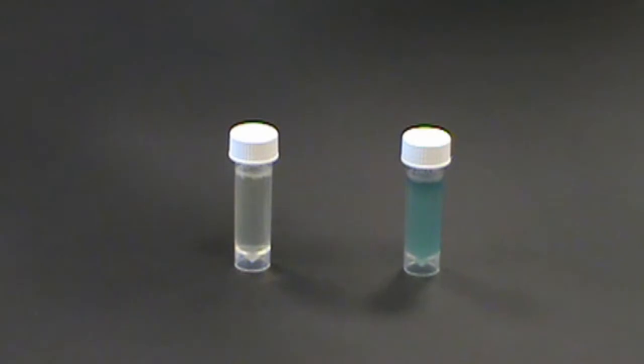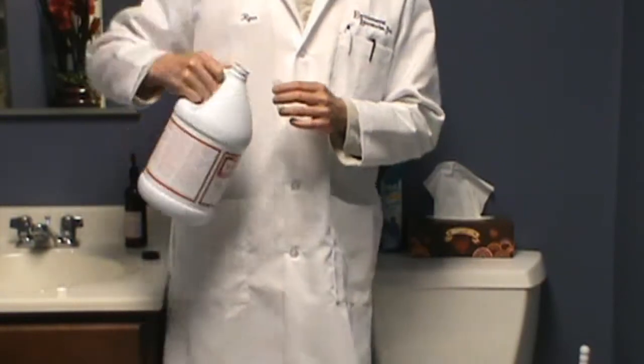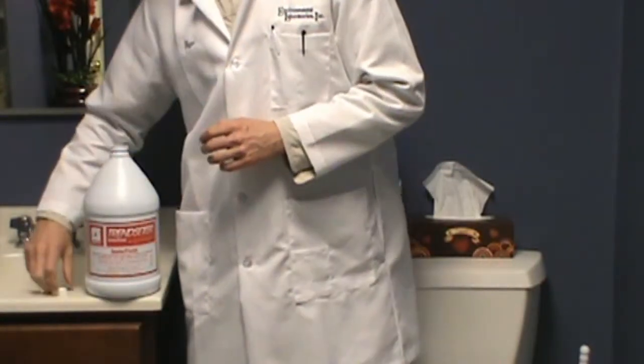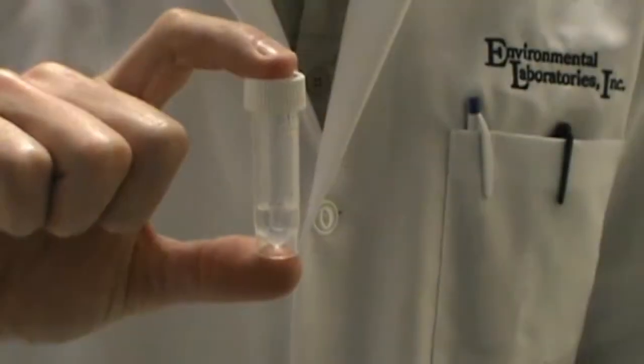Once you have established the bacteria content of your sample, you should dispose of both the sample and the vial. We find that the best way to do this is to go to your bathroom and pour the sample into the toilet. For samples yielding a positive test result, we strongly suggest placing a couple of drops of household bleach into the vial, replacing the lid, giving it a good shake, and also discarding this solution into the toilet.